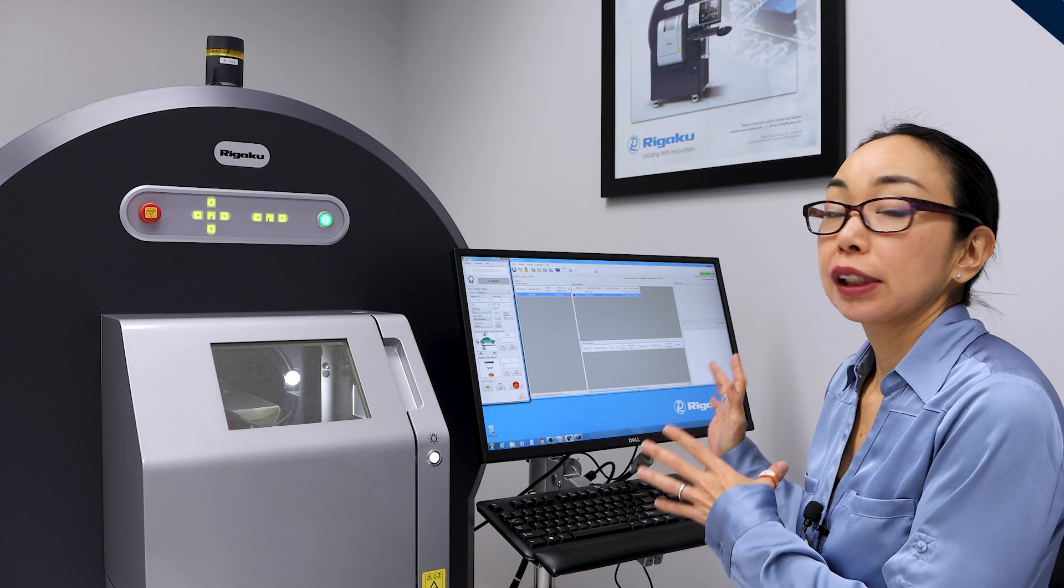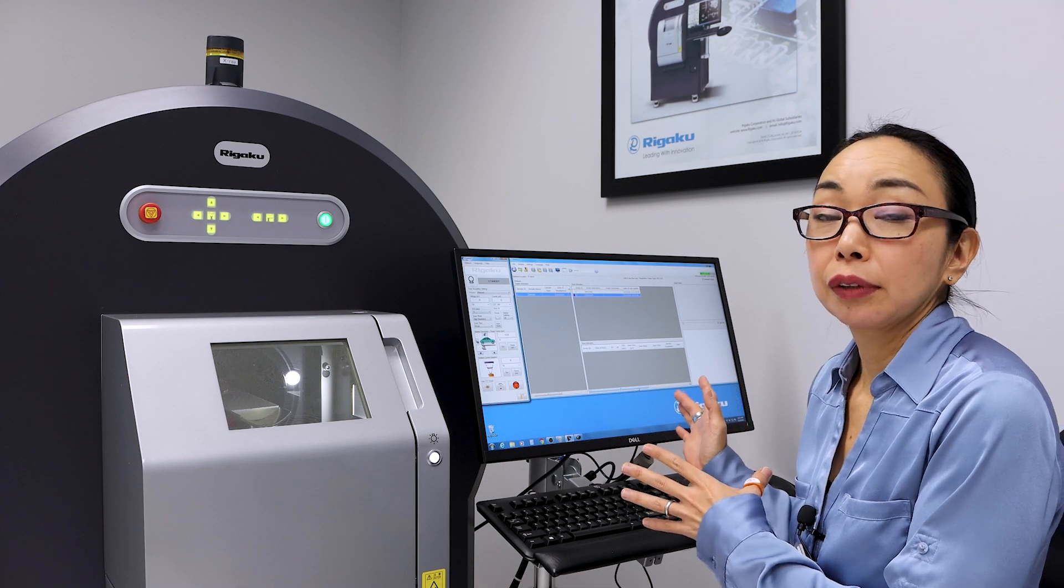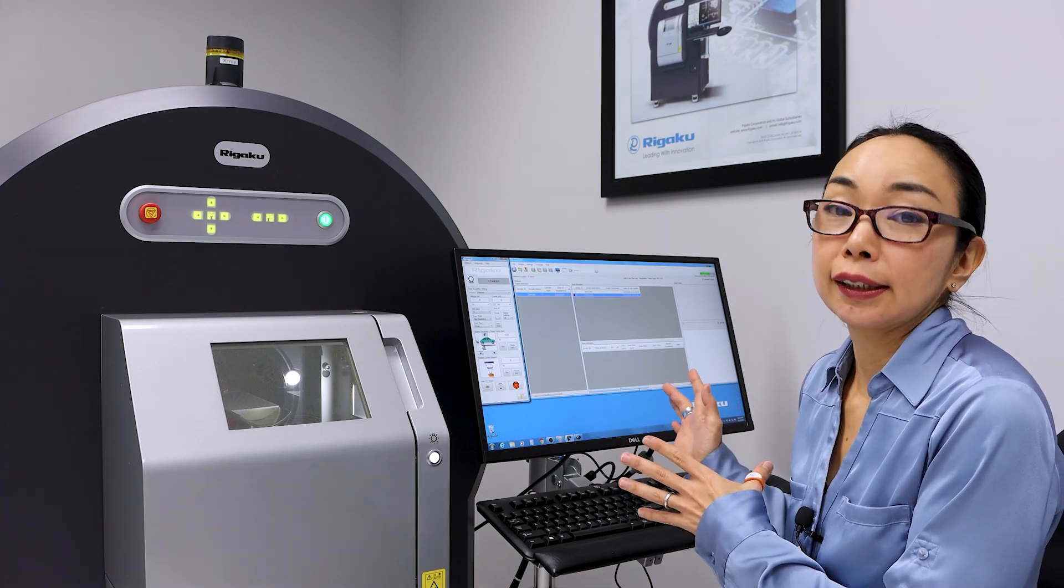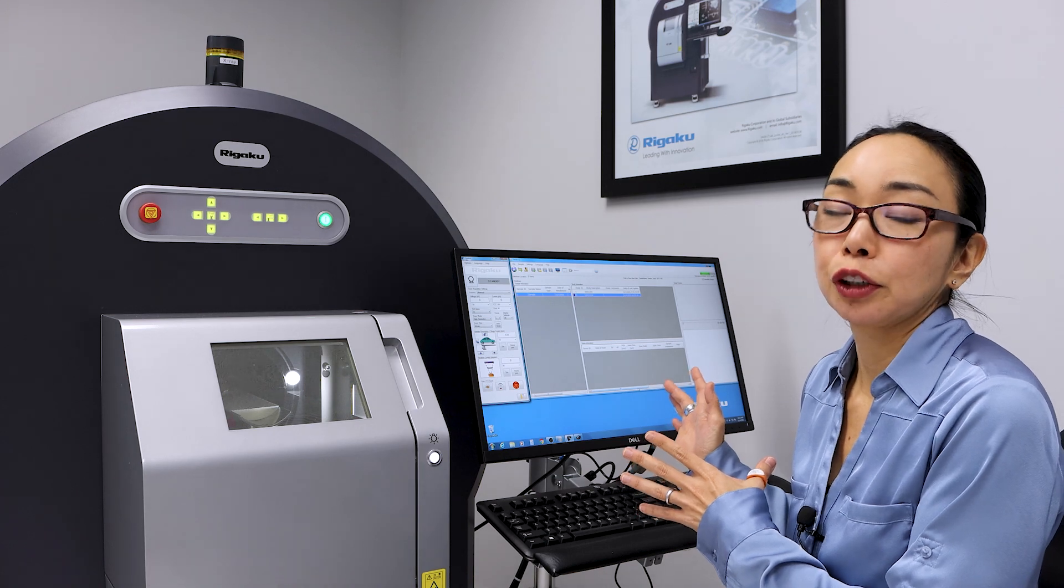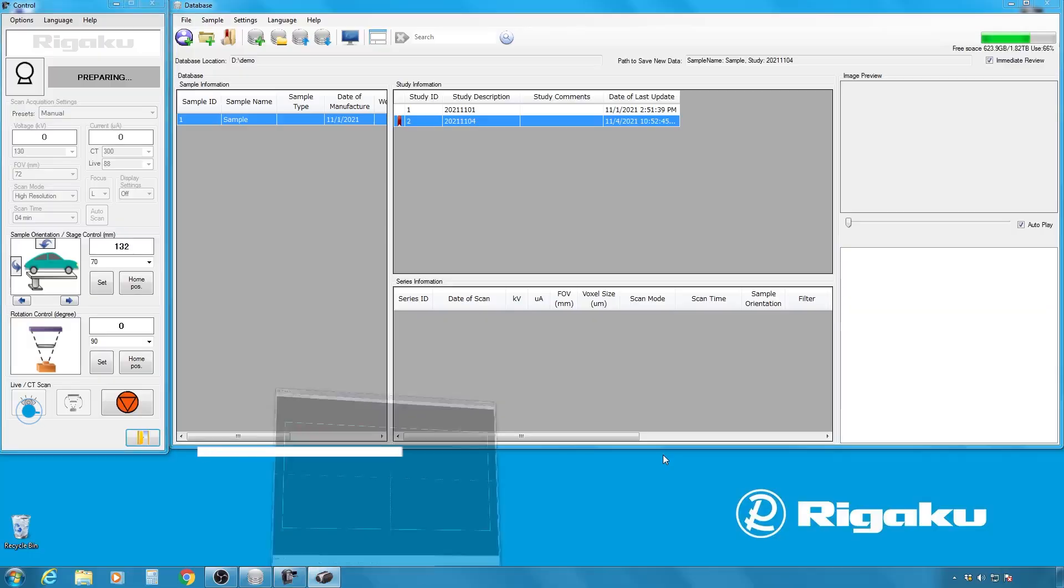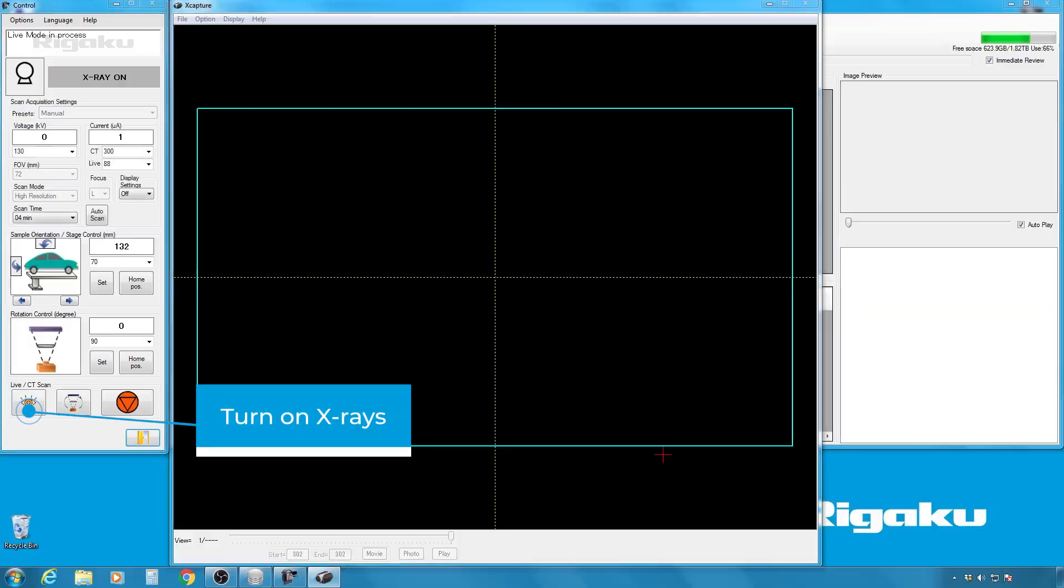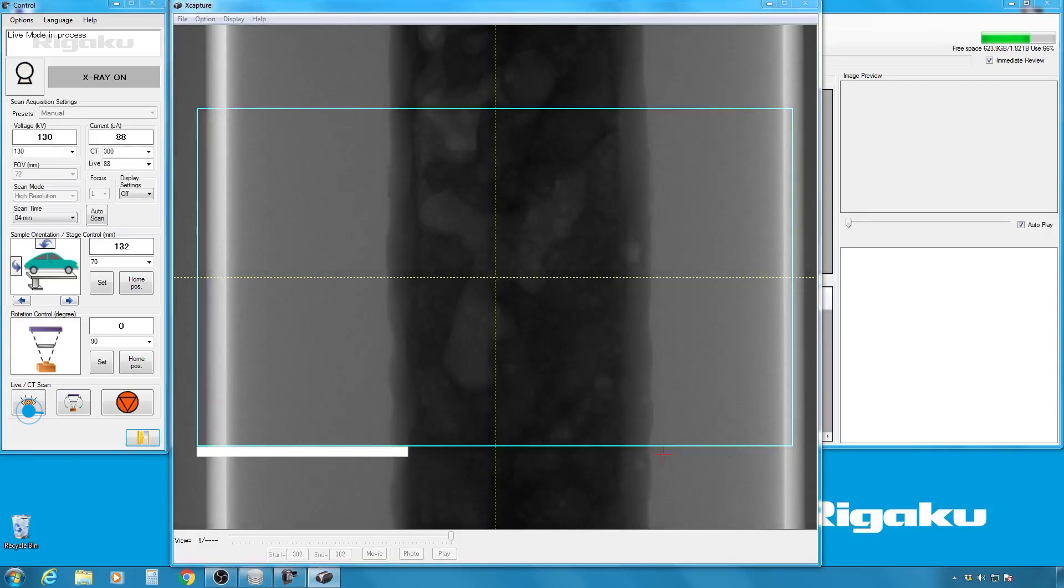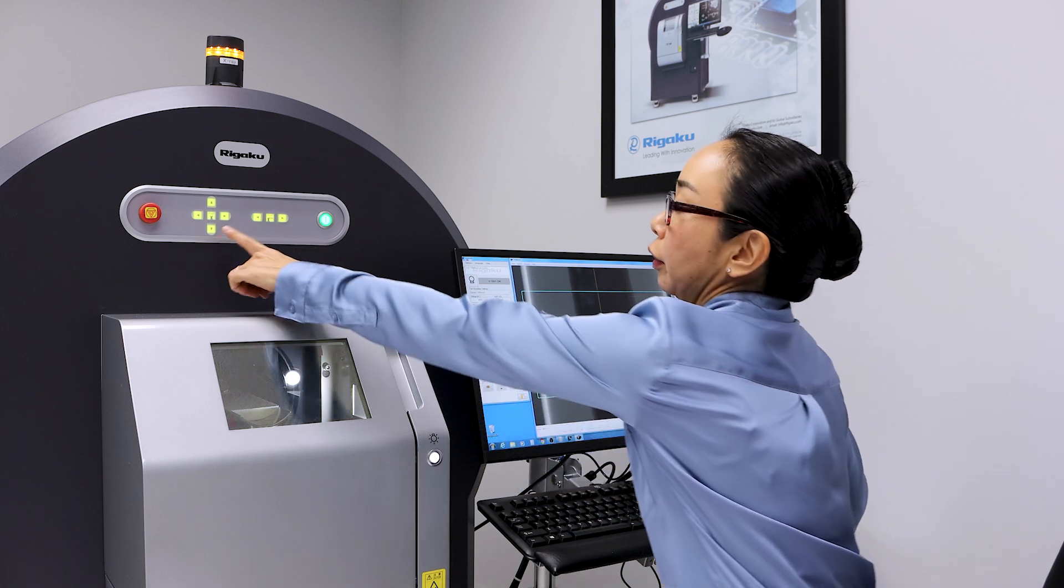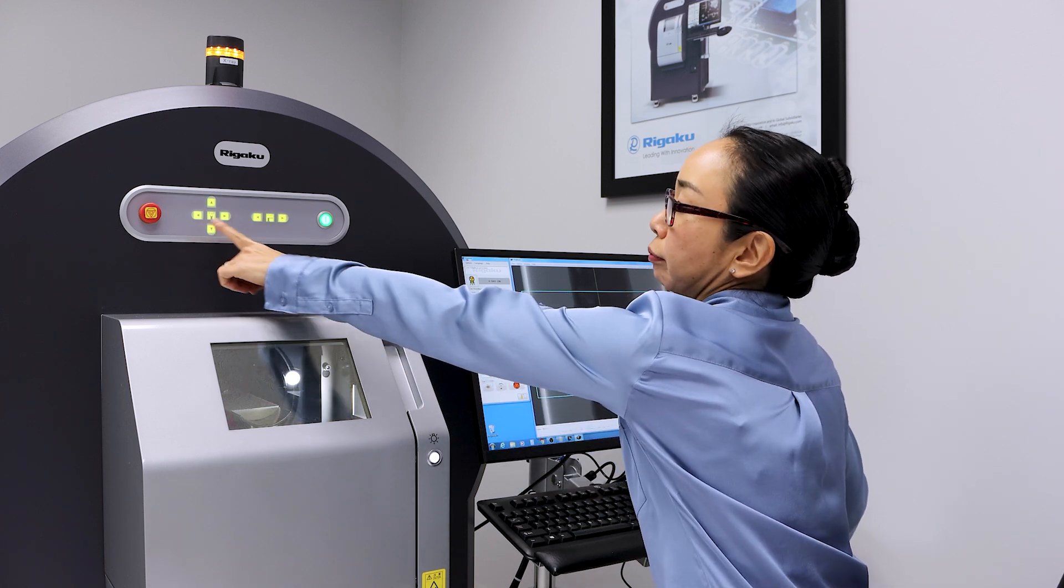Before you set the details of the scan, you want to align the sample, and let me show you how to do that. So first, you turn on the X-rays, and we're looking at kind of the center of the sample. And I want to start from the top of the sample, so I'm going to move this around. And to do that, you can use those buttons.